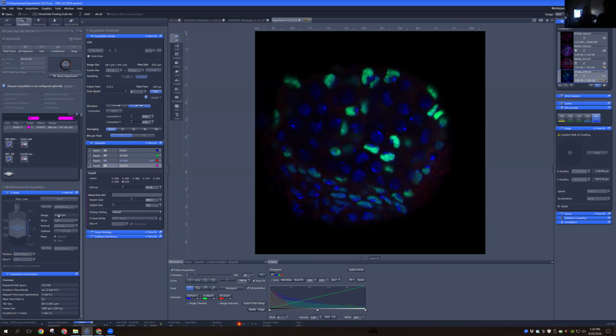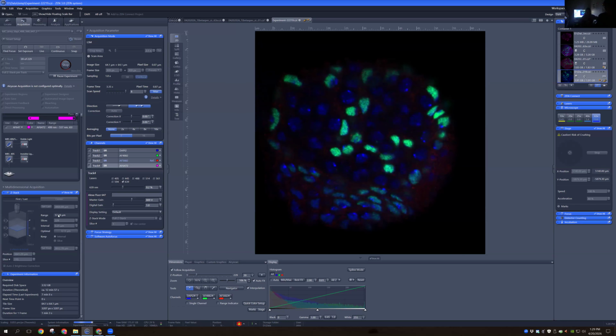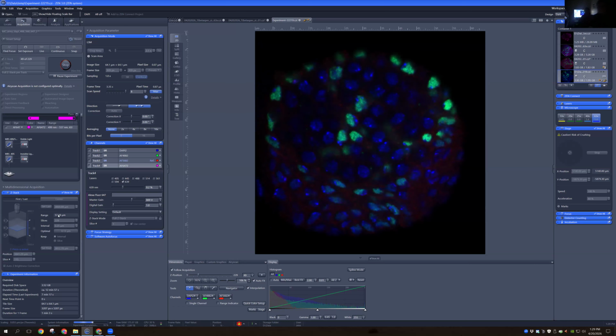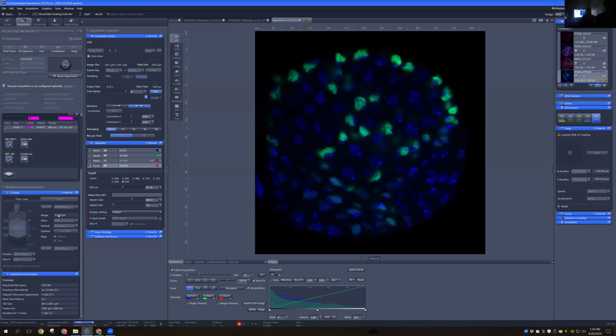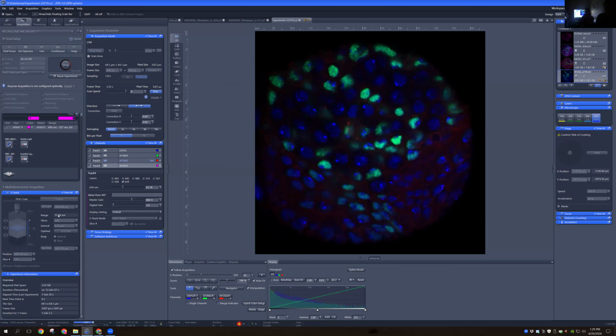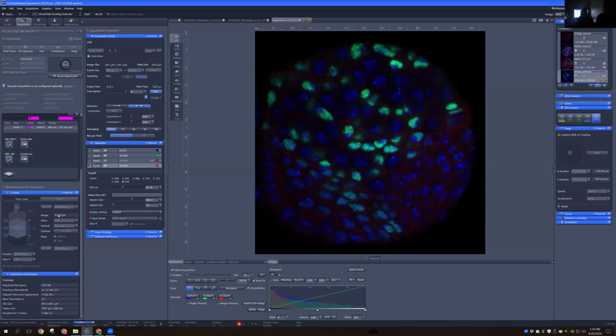And so as I worked with my collaborator in developing this protocol, we started with differently sized slices that were a little bit bigger, and that wasn't working for the program, so my collaborator said, okay, can we make them smaller? So it was very much a back and forth between us about the analysis side of things and the image acquisition side of things as well.